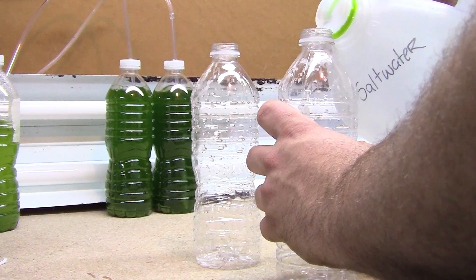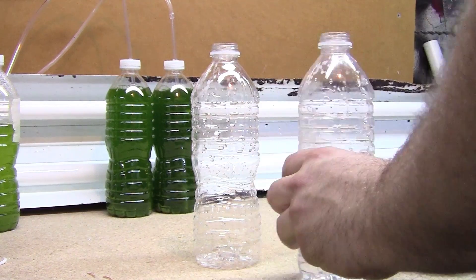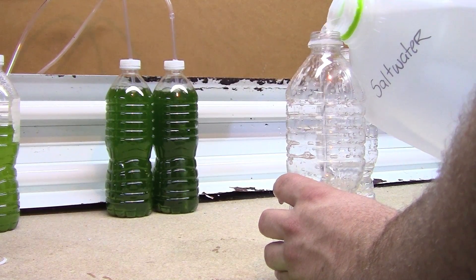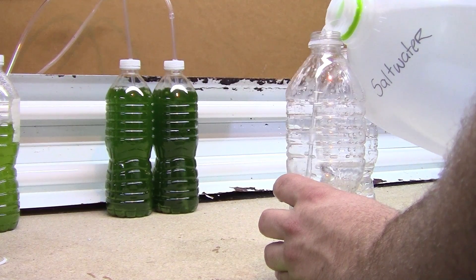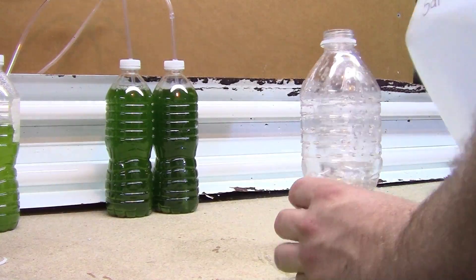Next we're taking some pre-mixed salt water that I mix in a one-gallon jug. I do this because I can mix it a lot faster and it takes the guessing out of it. With my salt, all I need is a half cup per gallon of water to get the right salinity for the phytoplankton.